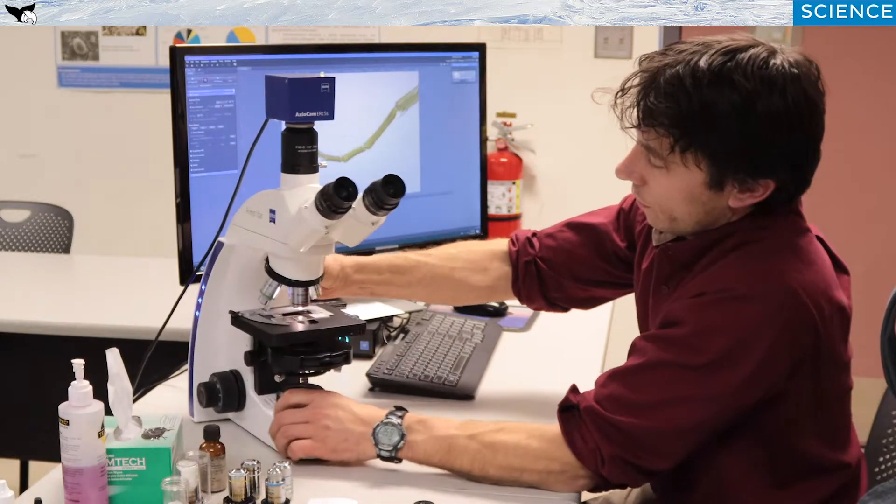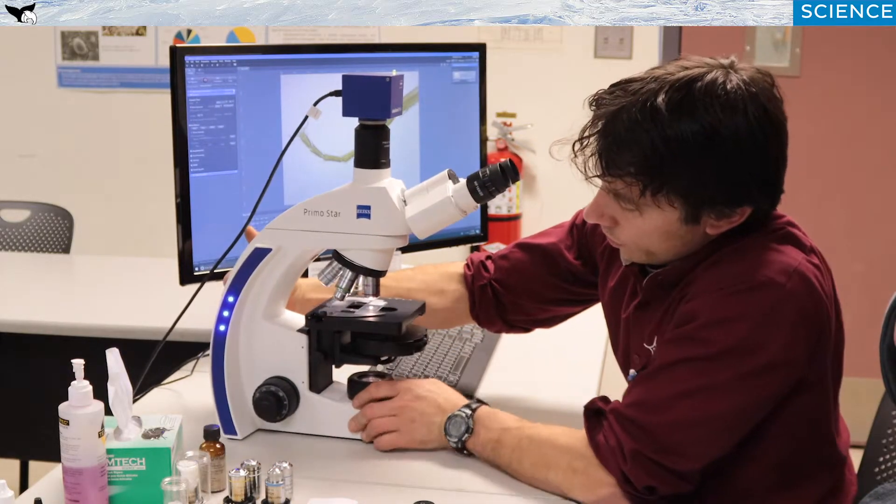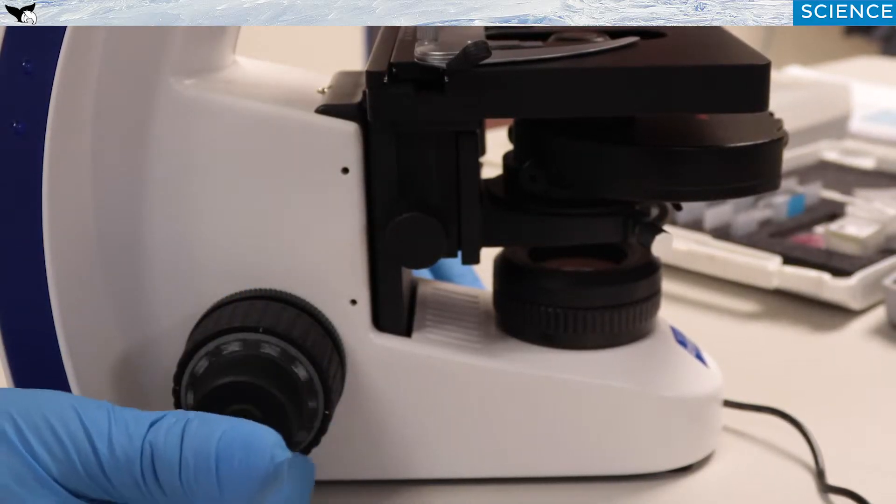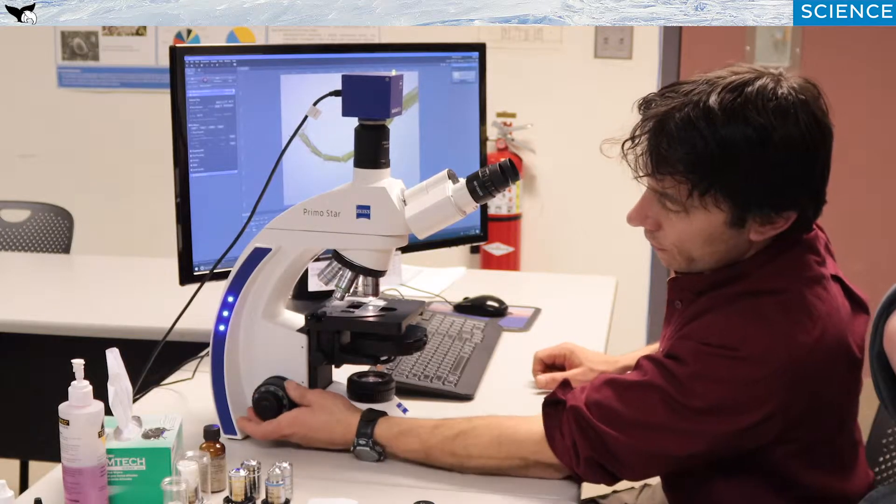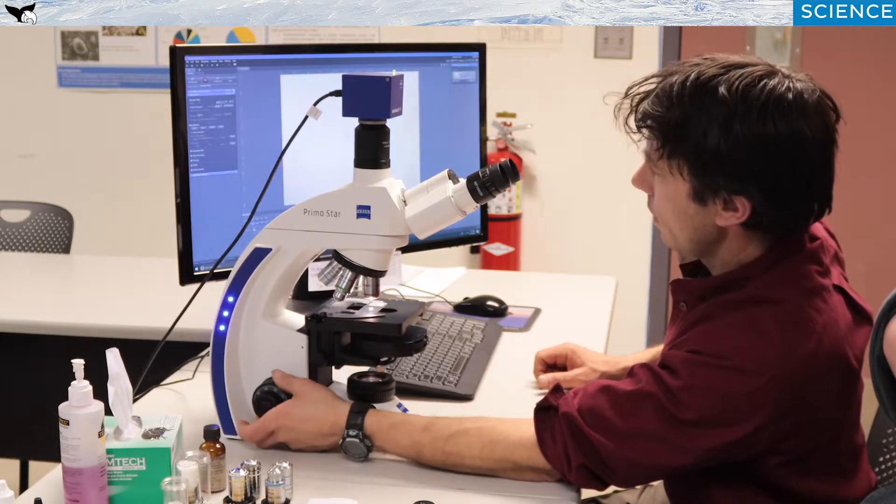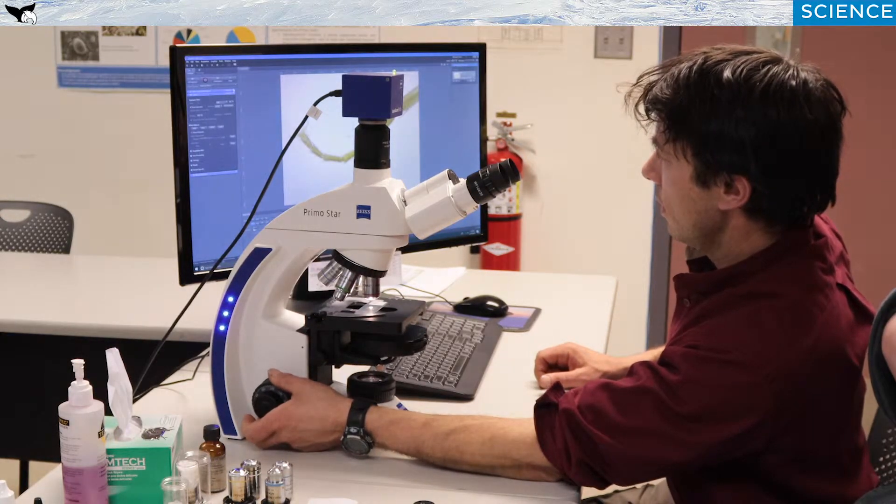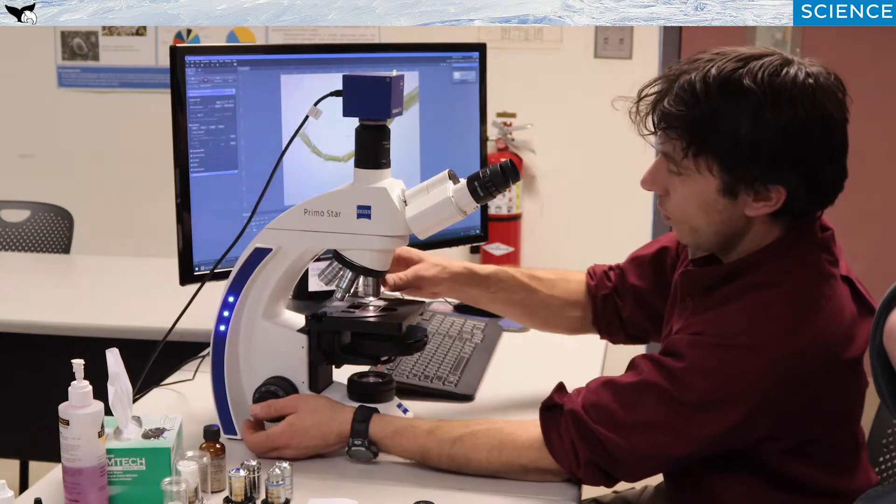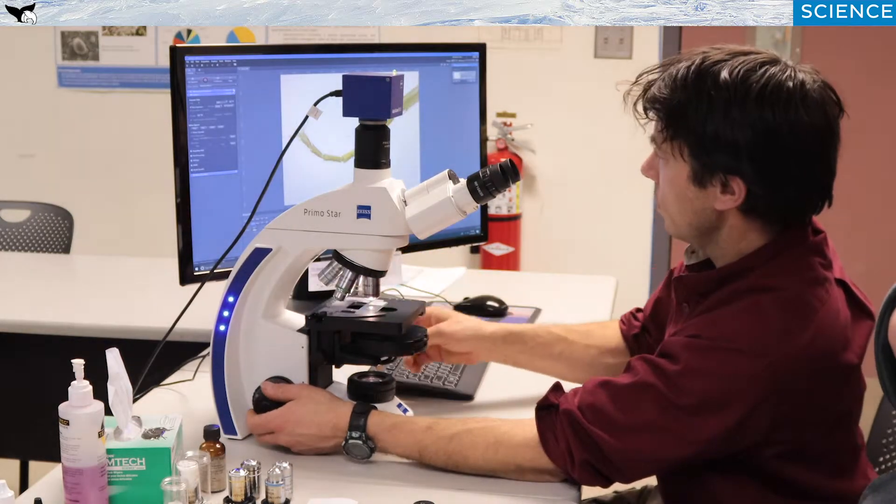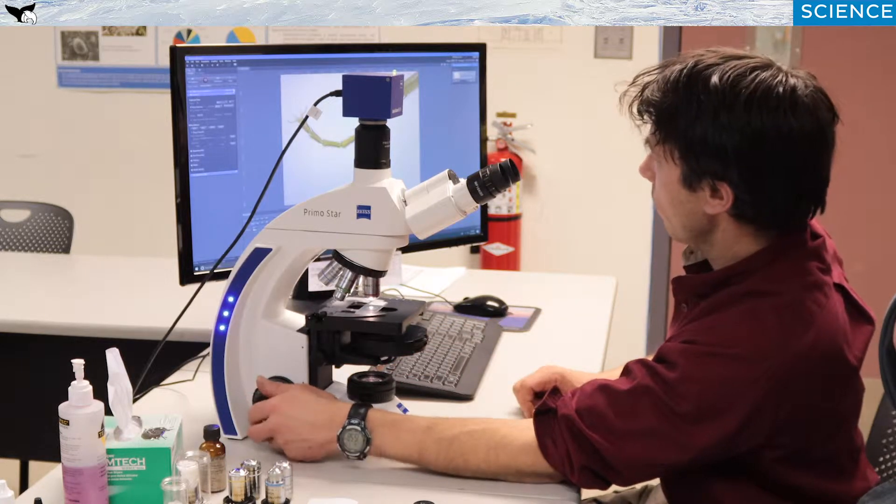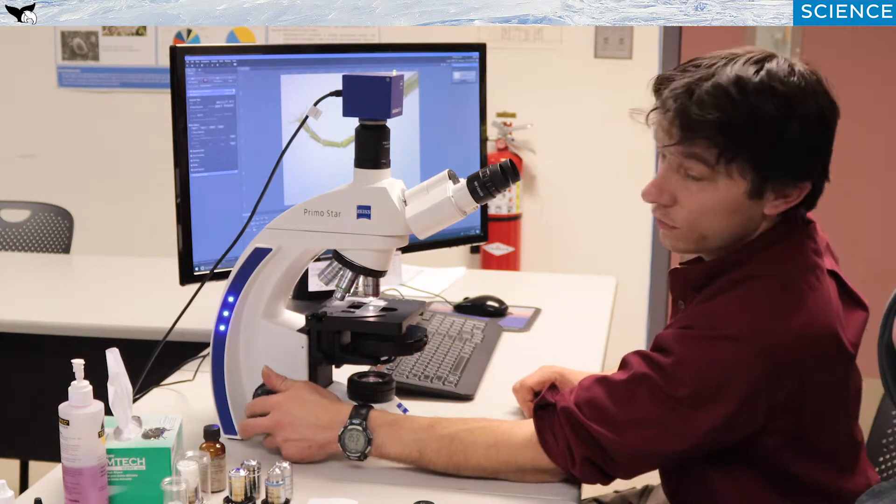And most compound microscopes, if you go to this type, have the fine focus, which is a fine adjustment outside of coarse adjustment. You can see how much displacement of the stage the coarse adjustment does. And this is typically just used on a low magnification objective to kind of get you in the ballpark of your specimen. And then most of your work will be done with the fine focus from here on.